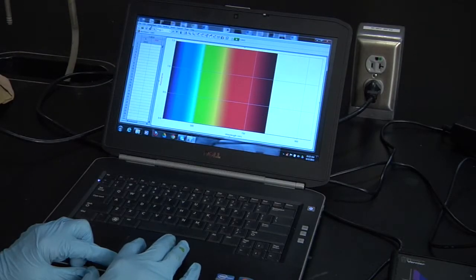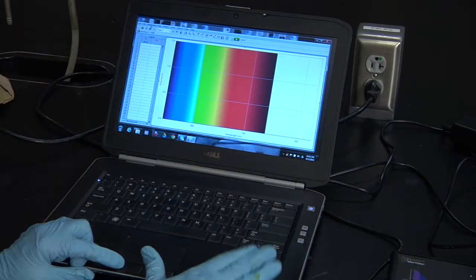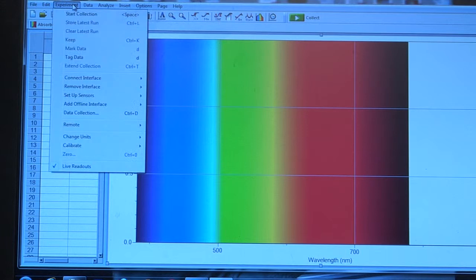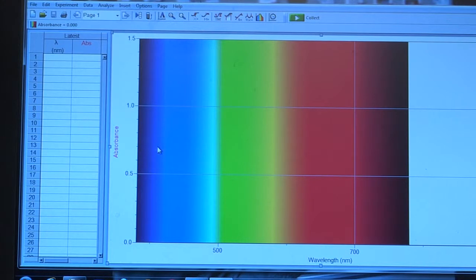We're going to go to our screen now, and so you can see the SpectroVis is connected to the computer, and we have software that is going to collect the data for us. But first, we have to tell the software what is a two-point calibration.